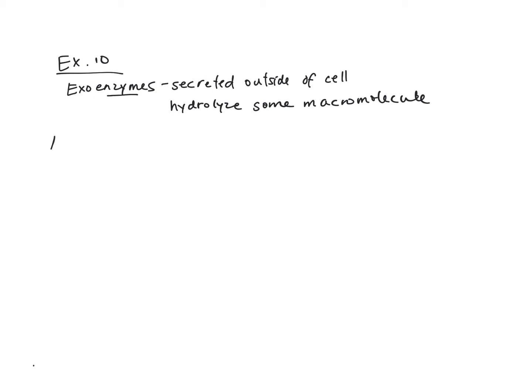All right, so the first one is a protein. Just remember that's a protein. It's one of the major proteins in milk, casein. And the enzyme we're testing for here is caseinase. I love it when the substrate, casein, is in the name of the enzyme. That helps you remember what's taking place here.